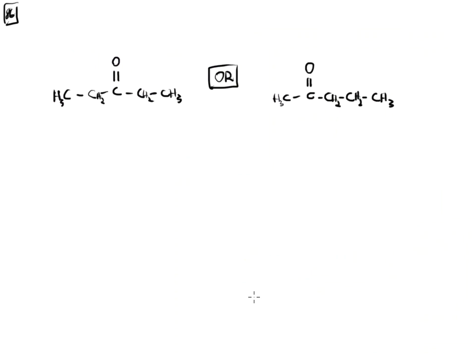Based on the infrared, based on the MS, I can at least tell you that this is a 5-carbon ketone. If I had to go up here and name them, just a review of organic chemistry. If you're not in there yet, don't worry about it. I'm not going to ask you to do this on the mass spec test. It's really organic, not instrumentation. Well, this is a ketone. 1, 2, 3, 4, and 5.